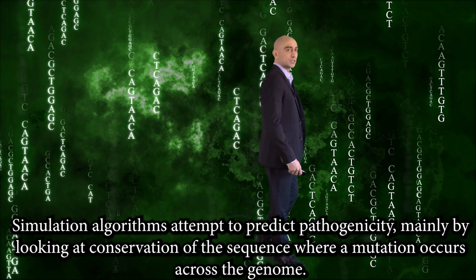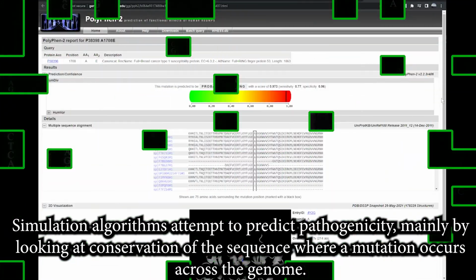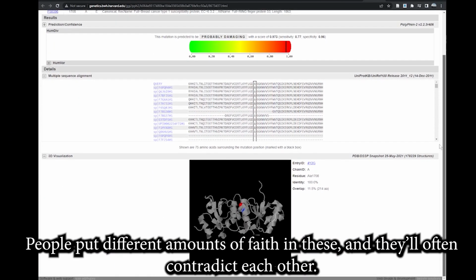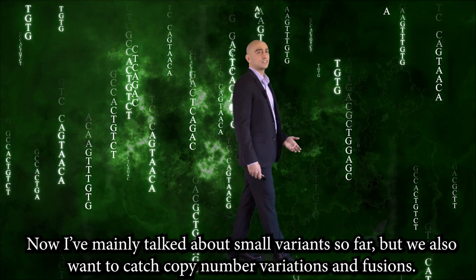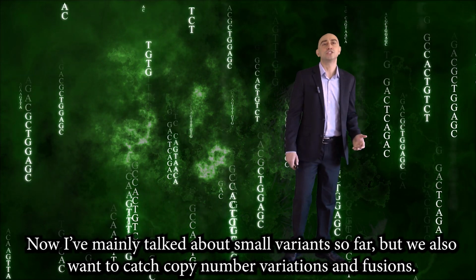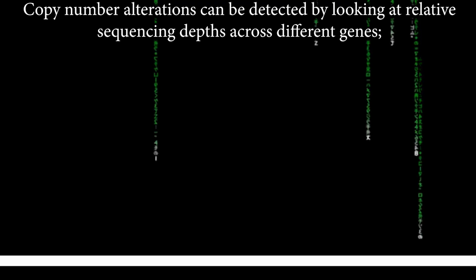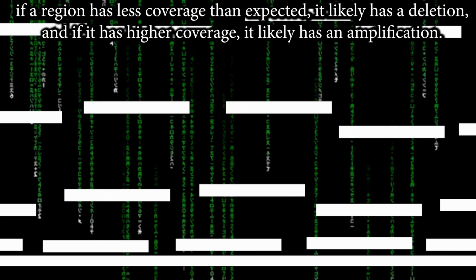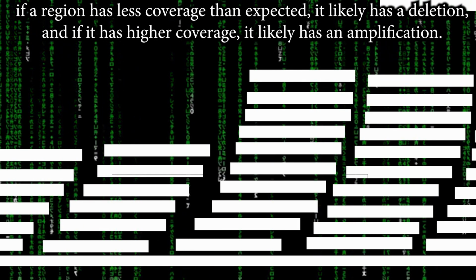Simulation algorithms attempt to predict pathogenicity, mainly by looking at conservation of the sequence where mutation occurs across the genome. People put different amounts of faith in these, and they'll often contradict each other. Now, I've mainly talked about small variants so far, but we also want to catch other things like copy number variations and fusions. Copy number alterations can be detected by looking at relative sequencing depths across different genes. If a region has less coverage than expected, it likely has a deletion. And if it has higher coverage, it likely has an amplification.